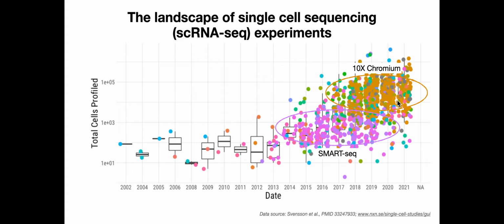So for the purposes of this lecture, we're going to focus on 10x Genomics and their Chromium controller. That's not to say that SmartSeq isn't really incredible technology, and it's not to say that other newer technologies won't feature really prominently in the single cell landscape. This just means it's a good place for you to start when you're learning about single-cell data because it's a very popular platform and one that's responsible for generating a lot of the data you're going to see in publications.